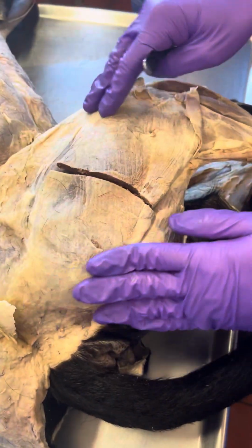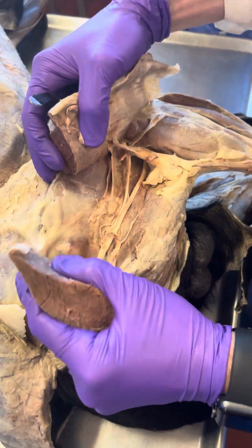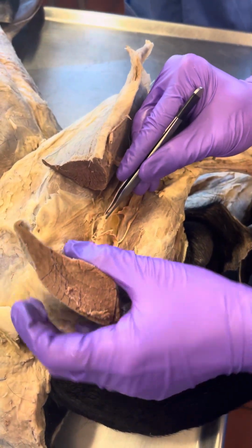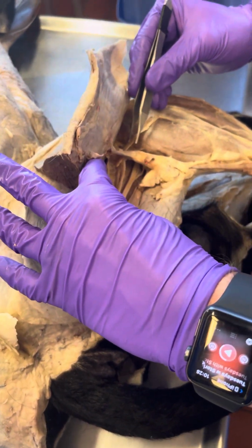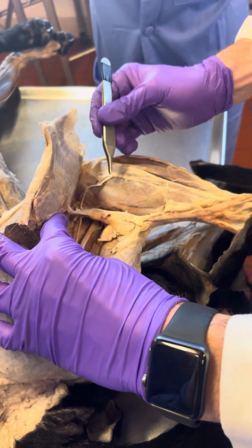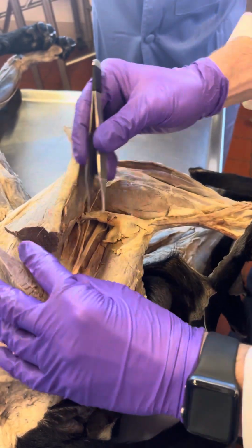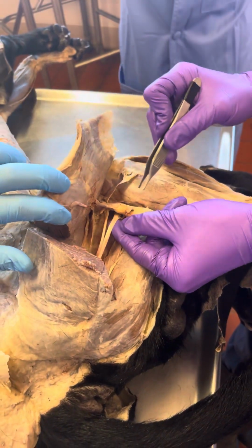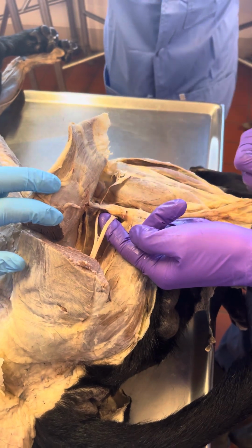We have the hind limb here, right? Here's biceps femoris. We have it transected here. So we're gonna look at the sciatic nerve, which is here. And then that branches into two nerves. So we have the common fibular here. It's going into the extensors. And that also branches into a superficial and deep branch. And then we have our tibial nerve here, basically going into gastrocs here and the hind limb flexors.